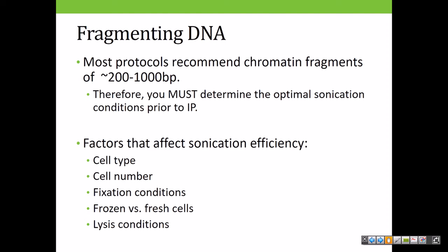200 to 1,000. Because of this, you have to determine the optimal sonication time and conditions to get this magical piece of fragmentation. Factors that affect sonication are cell type, cell number. If you got more DNA, you might have to sonicate longer. Fixation conditions, we've already talked about that, fresh versus frozen, and of course, lysing conditions.